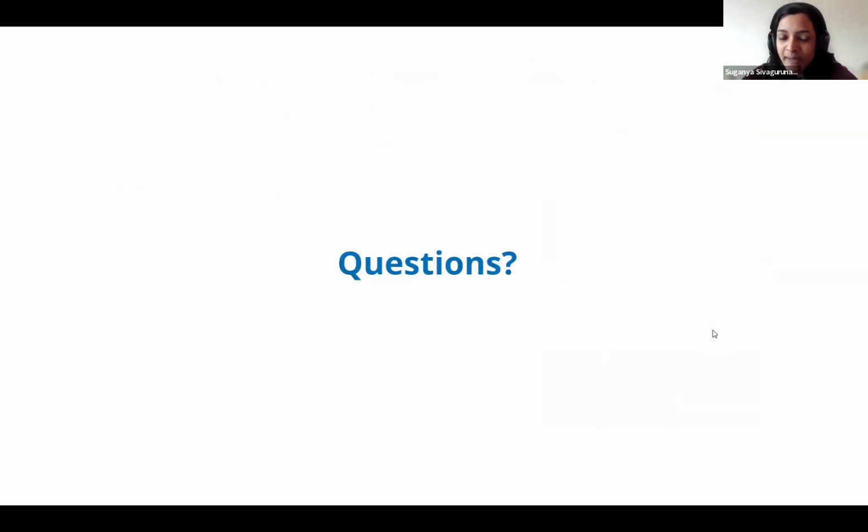And with that, I know that's a lot of information in a short span of time. I would like to know if you have any questions, and we'll be happy to help with that. Else, I'll move on to the next module. I'll give a couple of minutes to see if people here have questions on the primary object identification.